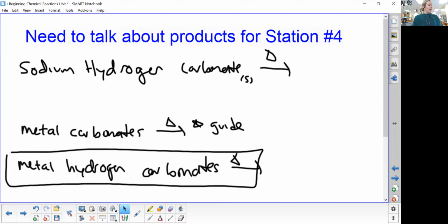So I want you to attempt to use your observations and what the guide says about metal carbonates to make a deduction about what the products will be for metal hydrogen carbonate. Come with your questions on that one tomorrow.